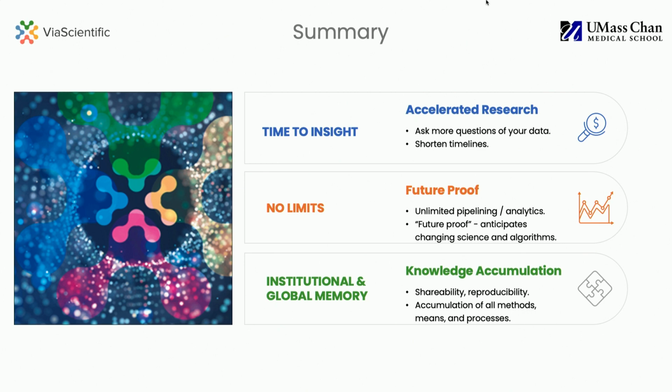So this was our dream, especially for profiling data. Imagine you have RNA-seq data, and you don't know what it is exactly. What's the quality of the data? Imagine you run enough RNA-seq samples to profile what's the quality of your samples, where it is when you compare to other published data. You can actually create a quality value.